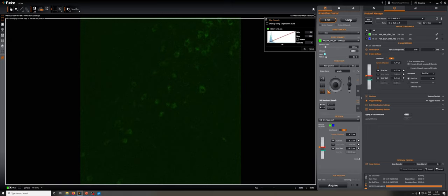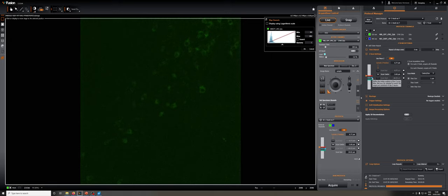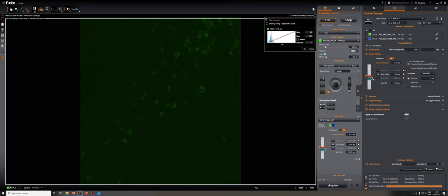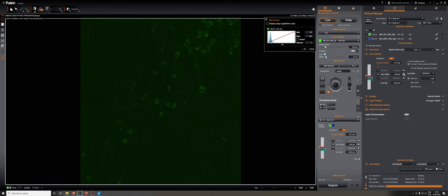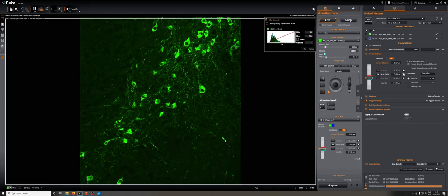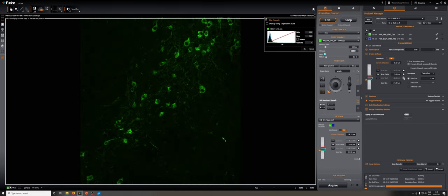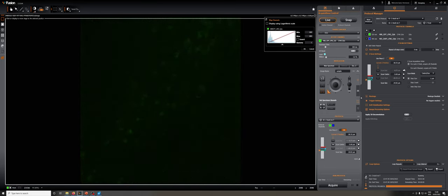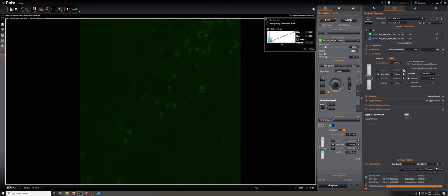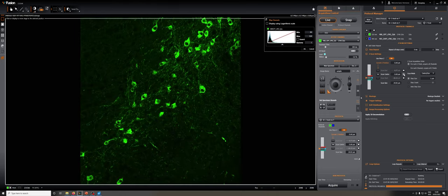If we were back in center size, we can adjust the band which we're going to image by adjusting that. There are several ways of setting this up. Once you have something set up, you can check where the center and the edges are to make sure you're happy with that.